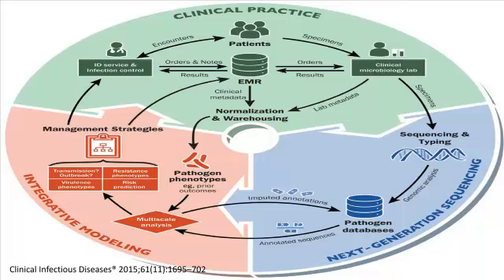Samples go into the process, and you get your pathogens accumulated in a database. We use that database for analysis, and we use the normals that we have. We put back what we find into the pathogen database, and eventually we'll come out with some answers.